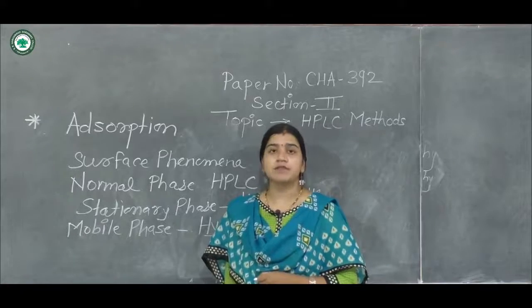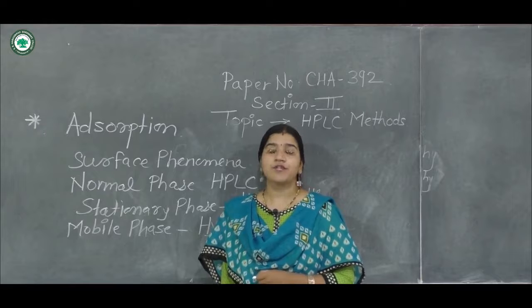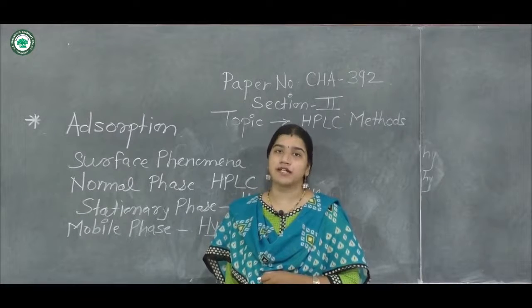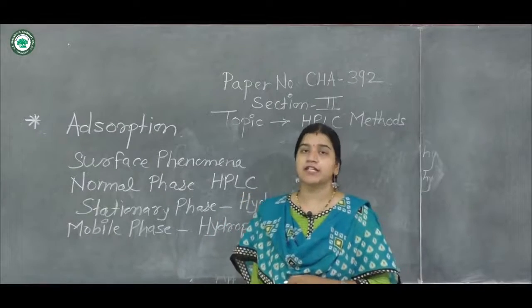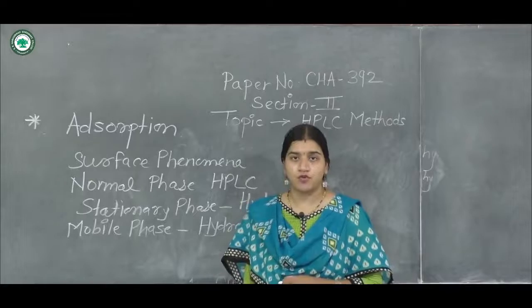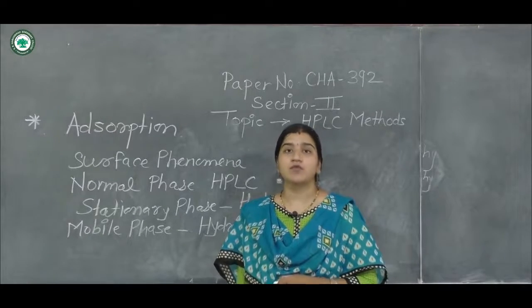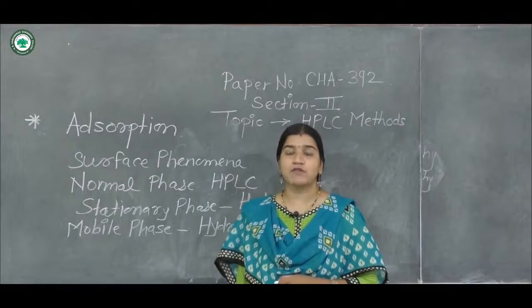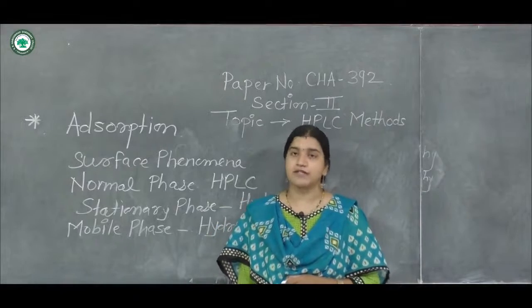Before that, what is the meaning of the words hydrophilic and hydrophobic? Hydrophilic means water loving molecules, while hydrophobic means water hating molecules. Whenever you are using an HPLC technique in which the stationary phase is hydrophilic and the mobile phase is hydrophobic, at that time you will call it normal phase HPLC. So adsorption chromatography is nothing but you are dealing with the normal phase HPLC technique.